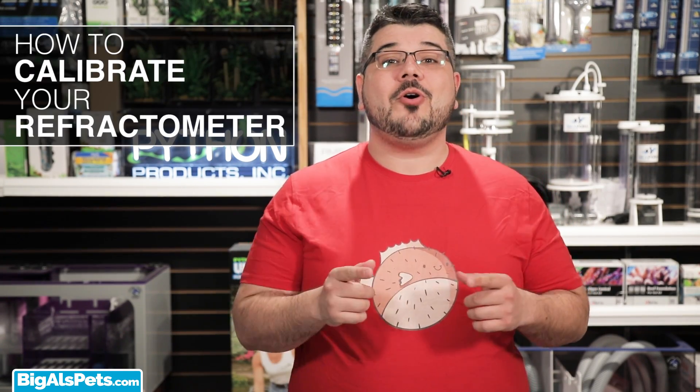Hey guys, Josh here and in this video I'll be teaching you how to calibrate your refractometer.